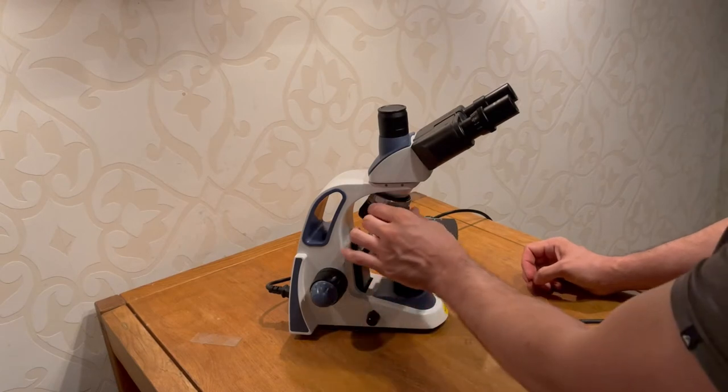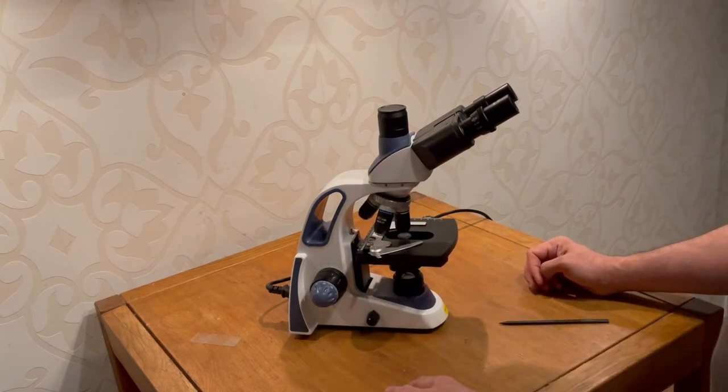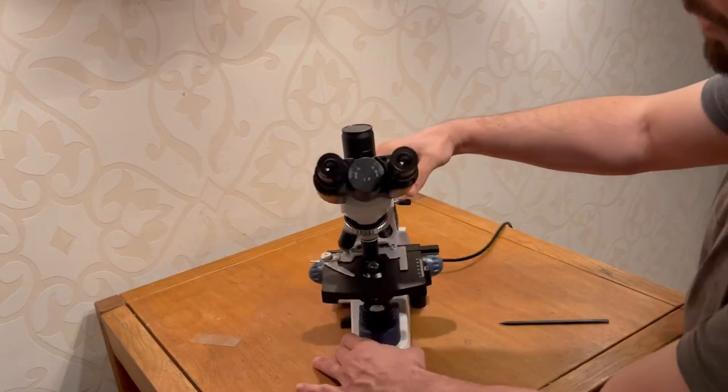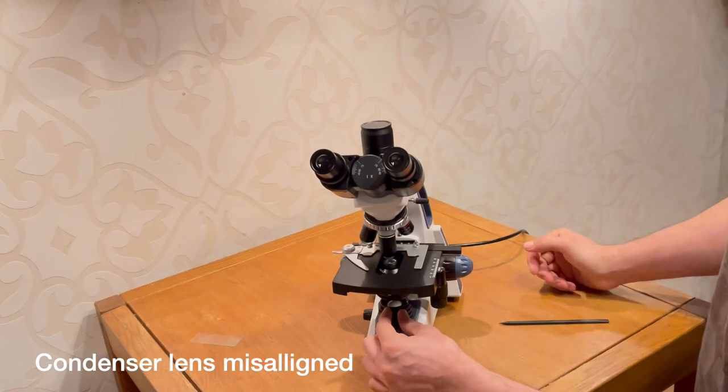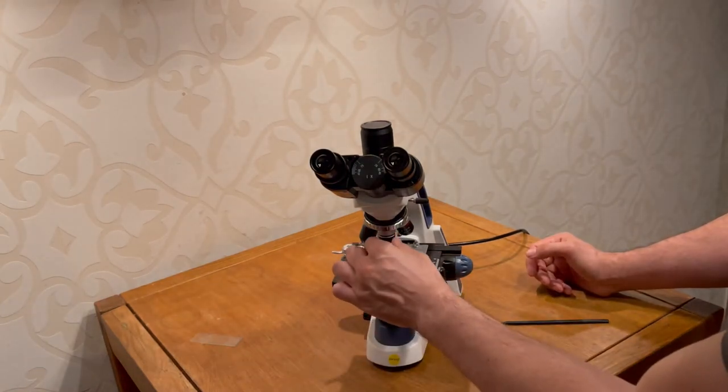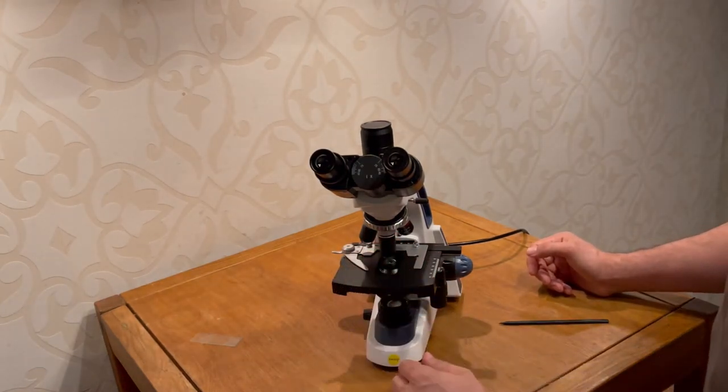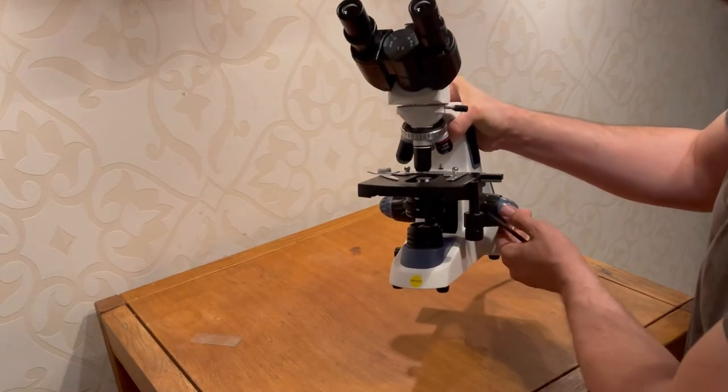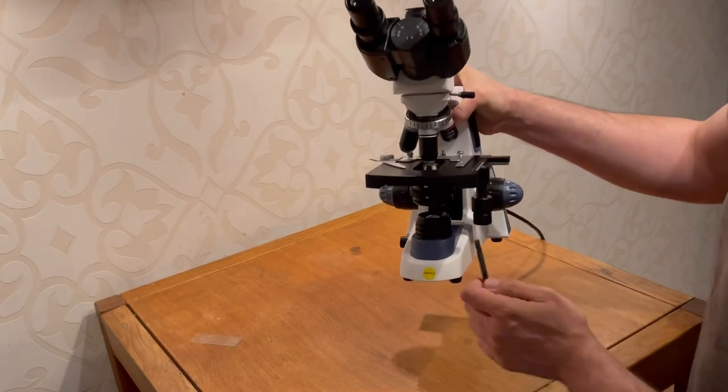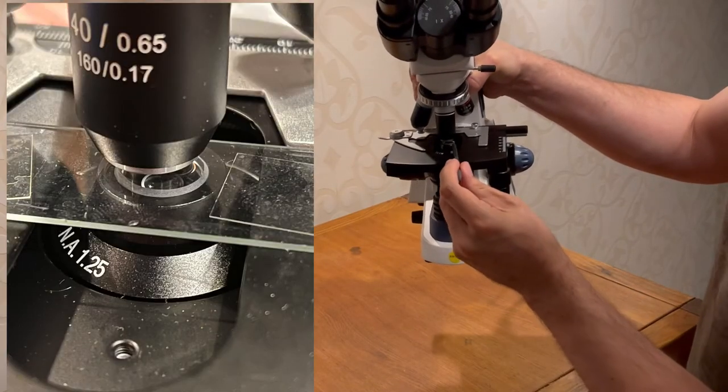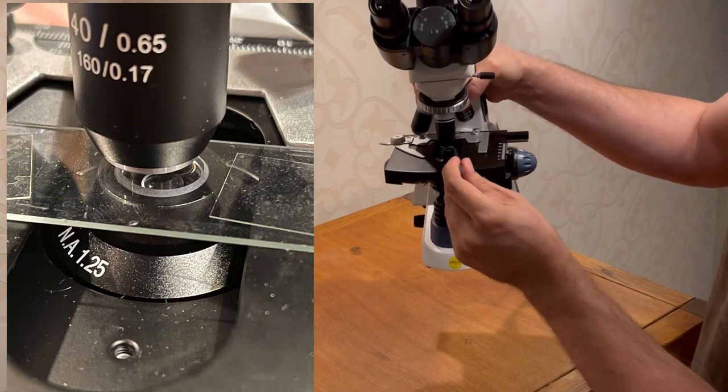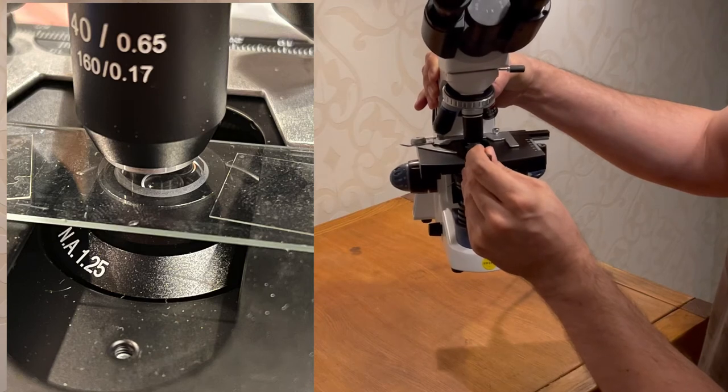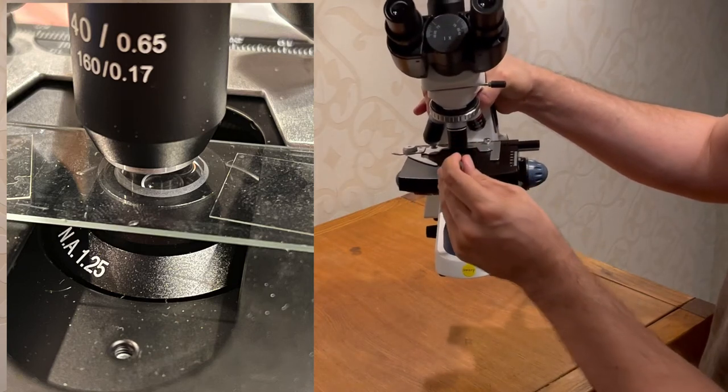The second thing, which is related to this kind of assembly, is that if you look, you don't have to look very carefully, but actually the lens and the objective, they are not on the same line. They are not centered. And it's very easy to see. I think if I will lift up the table all the way up, I hope you can see that. The objective here, it has like three, four millimeters here, and it has actually nothing. It goes over the side of the lens.